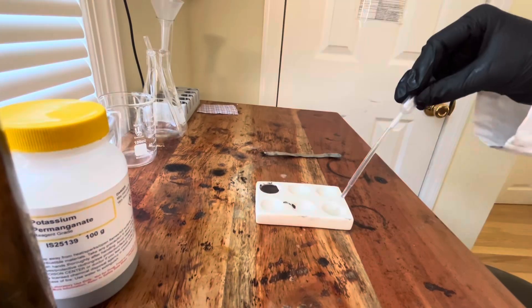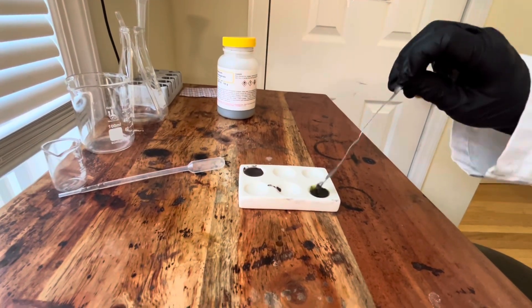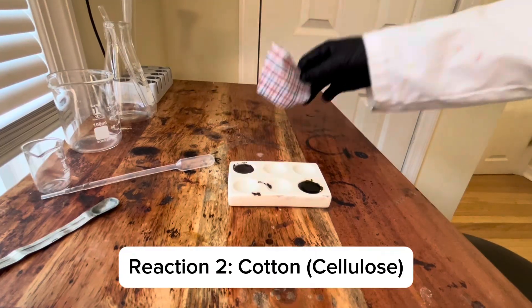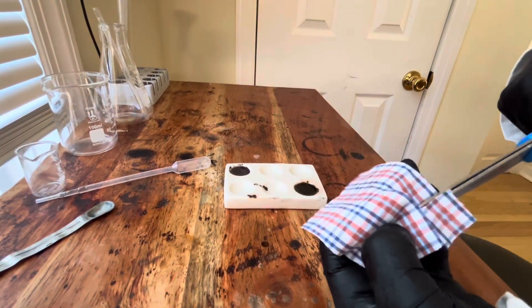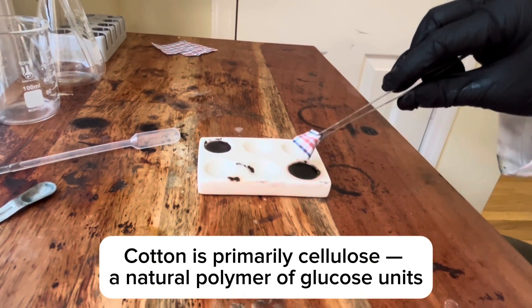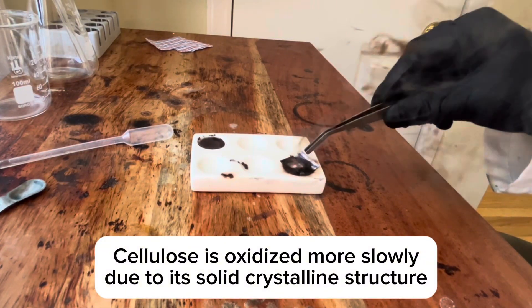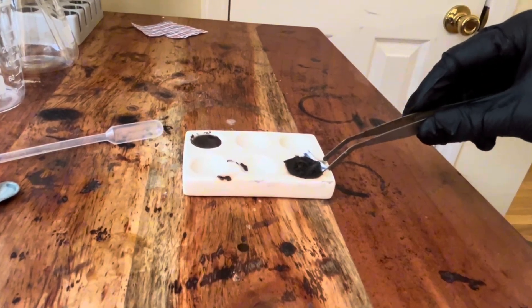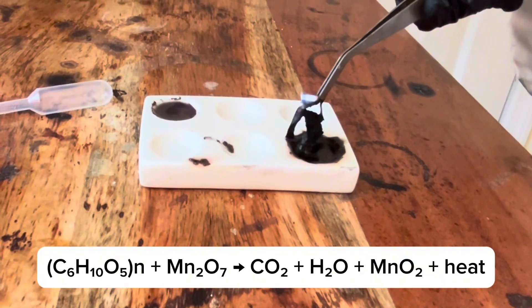Let's see what else it hates. Here's batch 2. This piece of fabric is also organic and flammable, but it's in solid form so the reaction will be different. It's a bit slower. The manganese heptoxide eats right through the fibers. You can see the cellulose dehydrate into carbon.